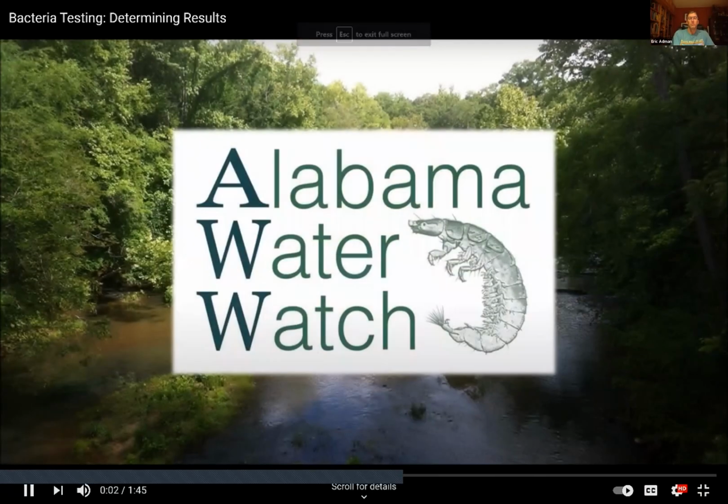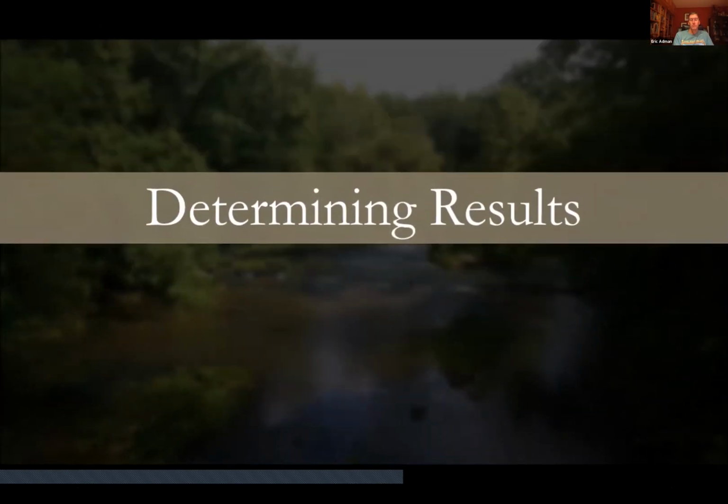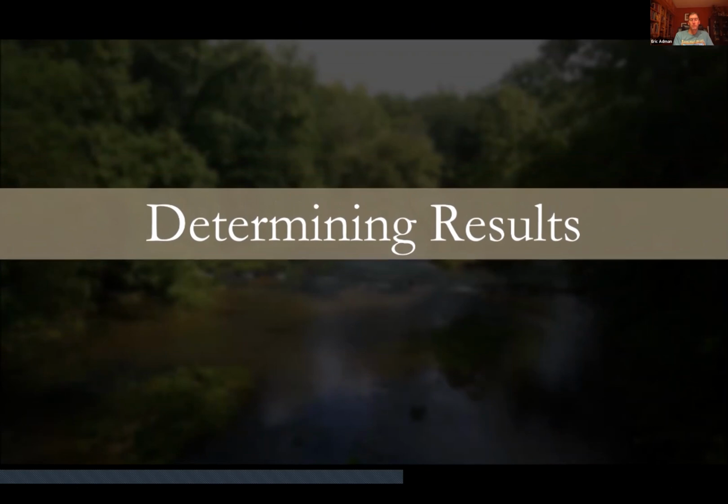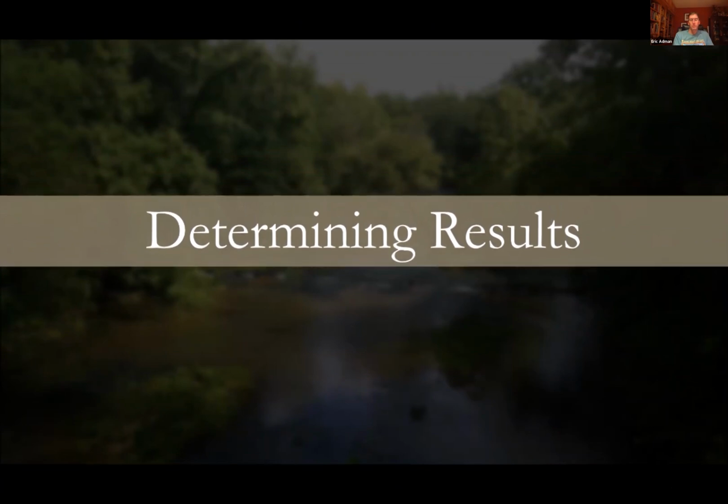Welcome to the Alabama Water Watch instructional video series. This video will show the proper method for determining the results of incubated water samples. This is the third step in a three-step process. The first and second steps, collecting the samples and plating the samples, are covered in their own separate videos.